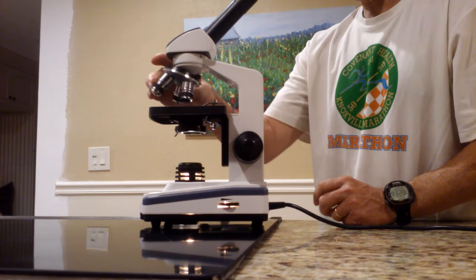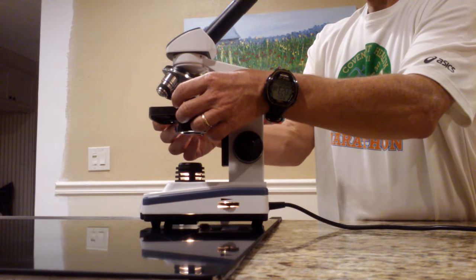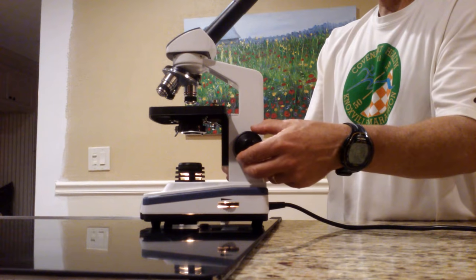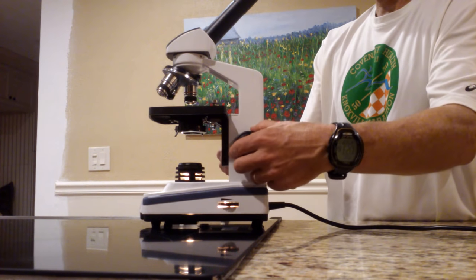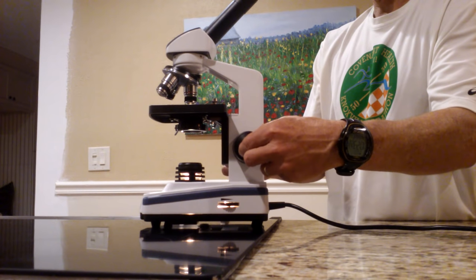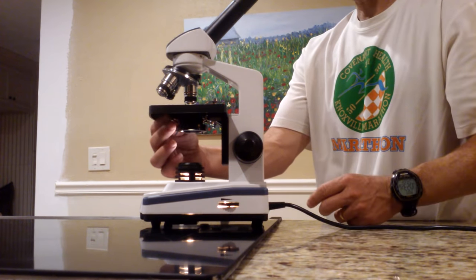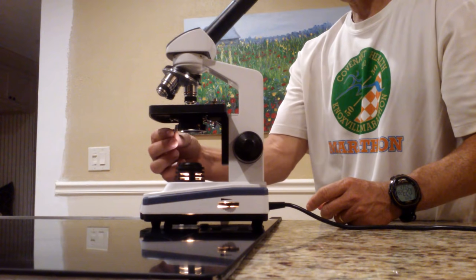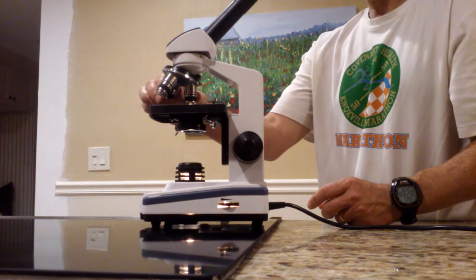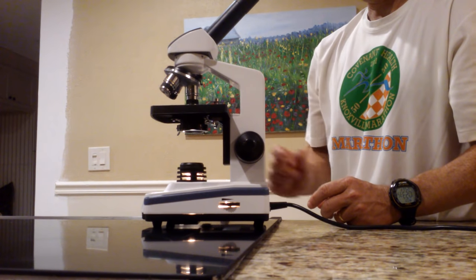As a recap: place the slide on the stage, put the clips on if you need to, start on low power, and use the coarse adjustment until it gets close, then switch to the fine adjustment. Adjust the light source a little, and use the diaphragm to adjust the light even more. Then you can move to medium magnification and then high magnification.